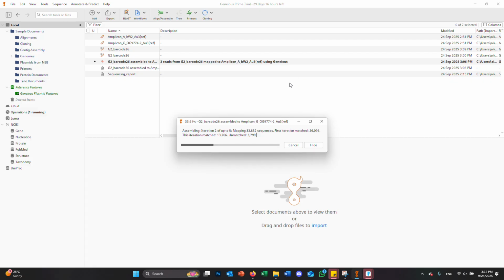But to be completely sure, rather than just looking at the similarity, you really need to look at more reference sequences from around the world. We have some additional reference strains that we'd like you to download now. More downloading from Google Drive. If you've been working with a particular amplicon, stick with the same one here. It's just more sequences of the same thing. Lots of different references, maybe 6 or more in one FASTA file.